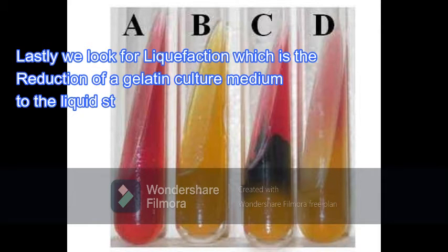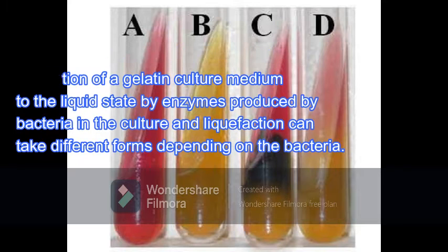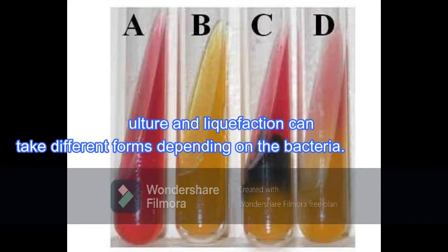Lastly, we look for liquefaction, which is the reduction of a gelatin culture medium to the liquid state by enzymes produced by bacteria in the culture, and liquefaction can take different forms depending on the bacteria.